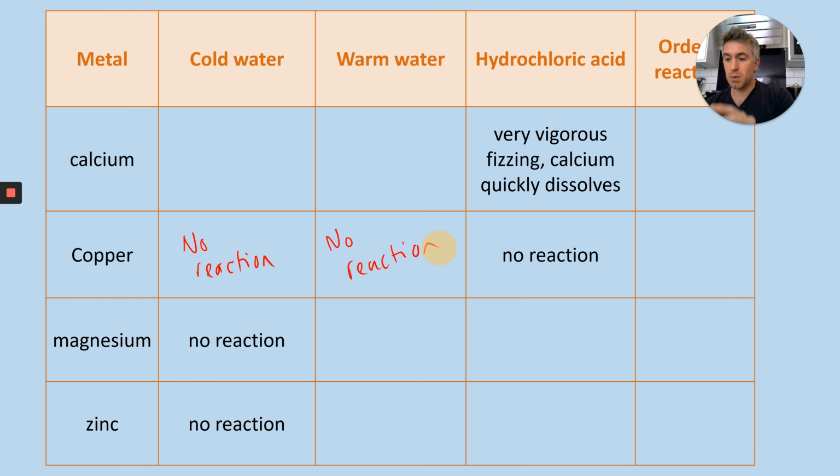And then we notice these ones. The most vigorous reaction is going to be with hydrochloric acid. The least is with cold water. So whatever happens to this hydrochloric acid, it goes down in reactivity.